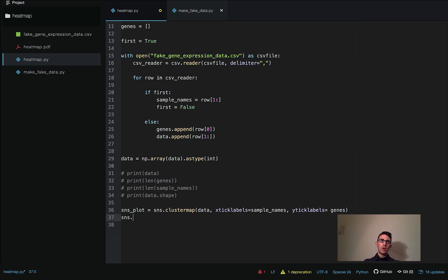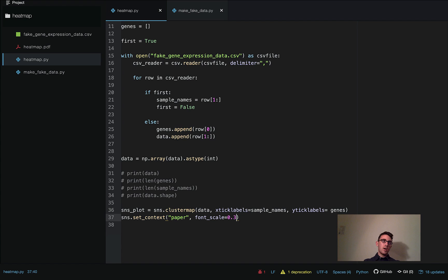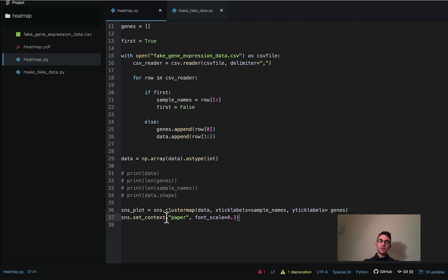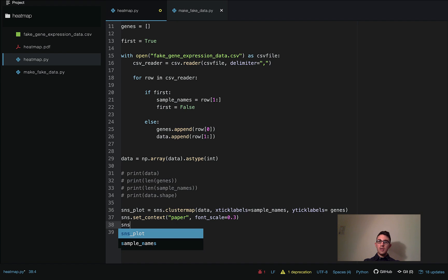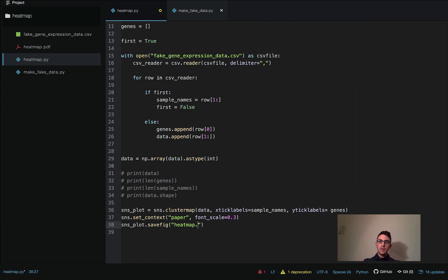I'm going to add a line to scale the font properly to make sure it's not all jumbled and we can actually read it: `sns.set_context('paper', font_scale=0.3)`. This is just cosmetic — you could leave it out and it'll still work fine. Then to save the plot: `sns_plot.savefig('heat_map.pdf')`, and finally `plt.show()` which will display what the heat map looks like.